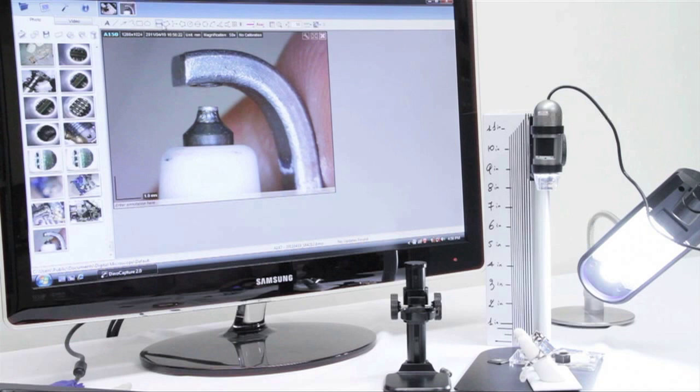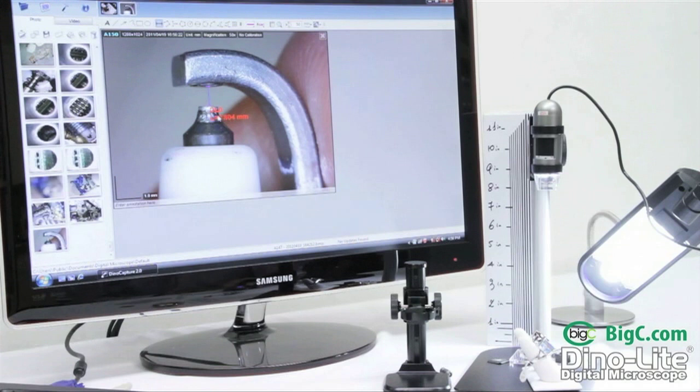We'll pick a line, then select a starting point and ending point, and it will give us our measurement. Here we'll make a measurement of the arc.